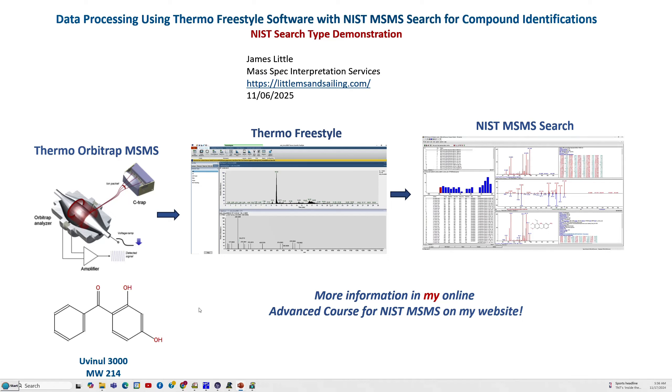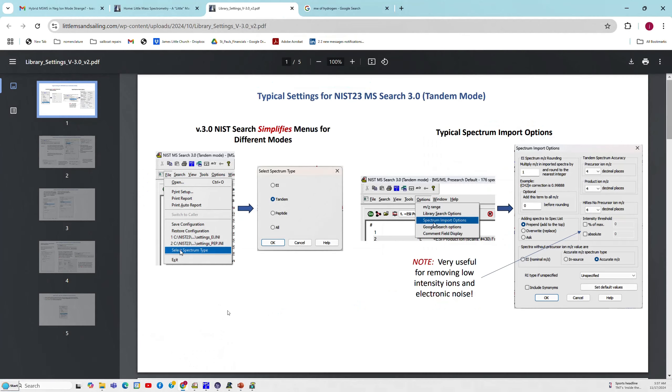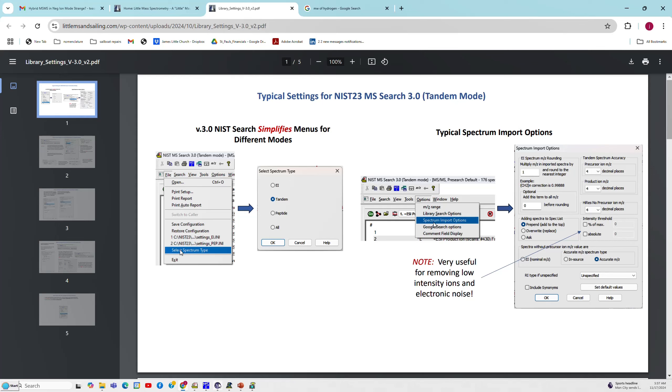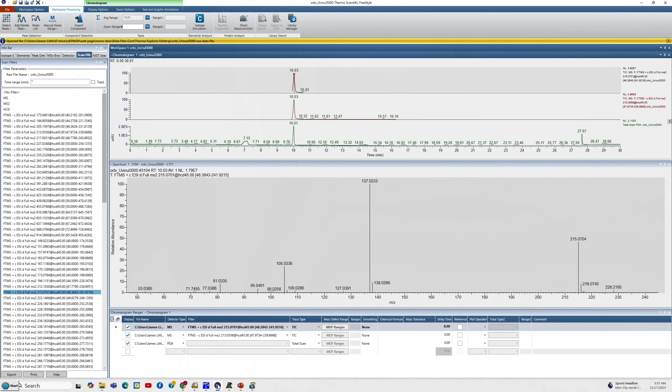Today I'll be using the Uvenol 3000 which has a molecular weight 214 to demonstrate the software. And also you'll find some useful information on my website and in the handout for this that shows the typical settings that one employs for the NIST 23 MS Search 3.0 tandem mode part of the software and it also talks about the different searches and there are also some details on how to set up the standard parameters for it.